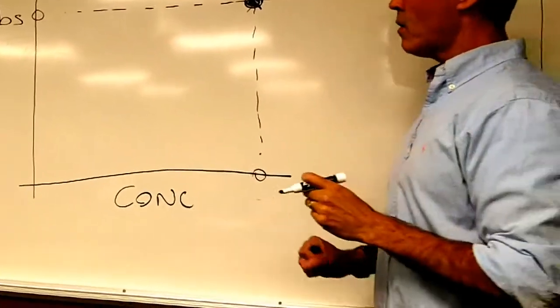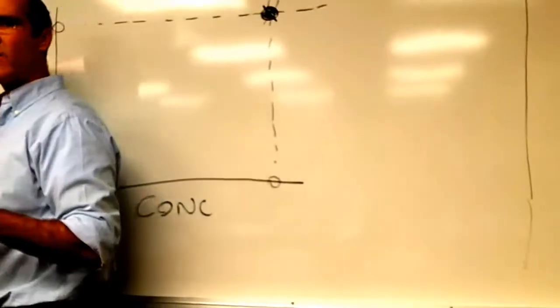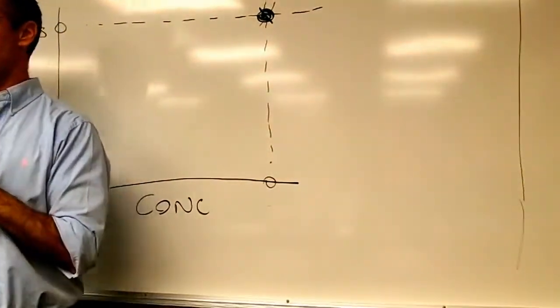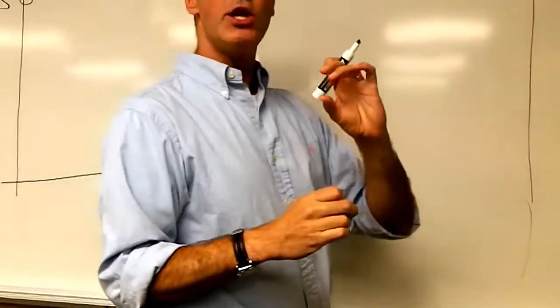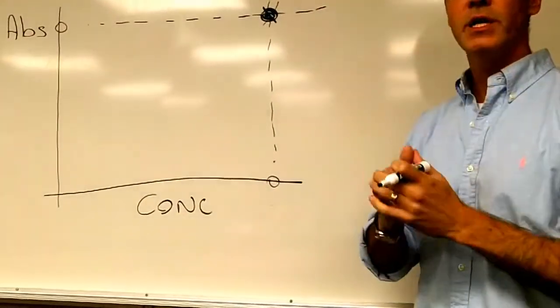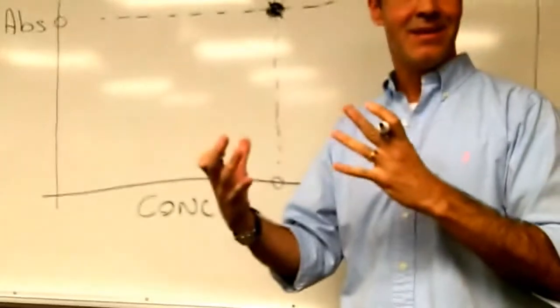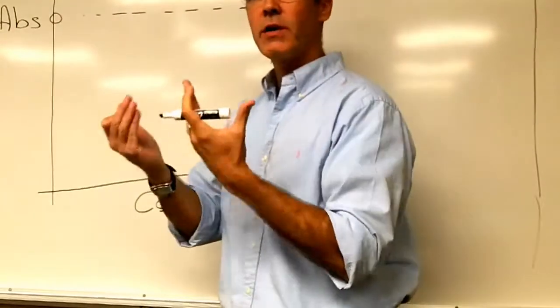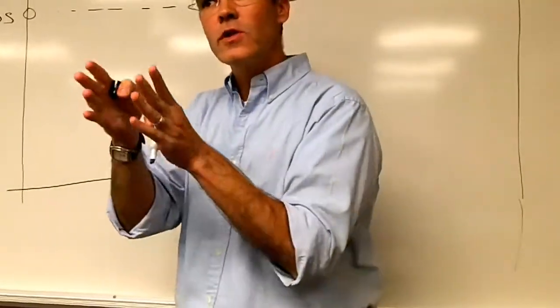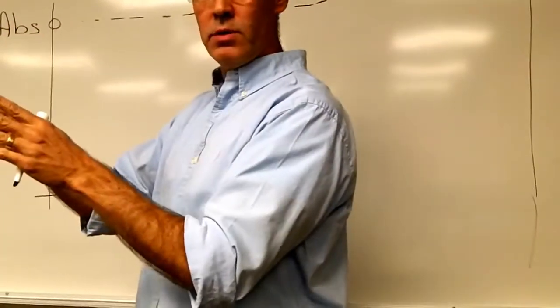Okay? So when you have an unknown, you have a solution and you don't know what the concentration is. Yesterday we were lucky because the unknown has a color and it was green. So visually you could have an idea of what concentration there is when you compare this unknown with diluted solutions that you're making in a tube.